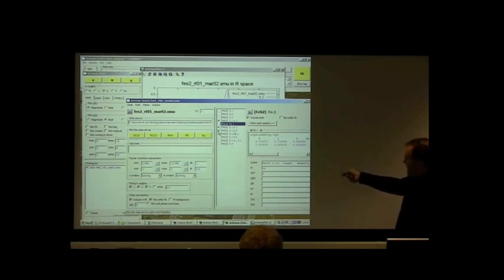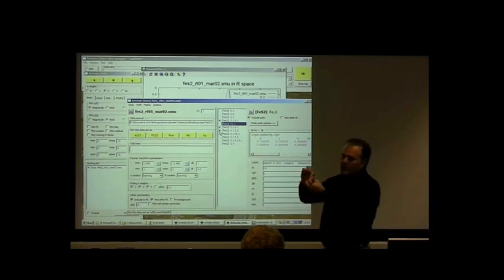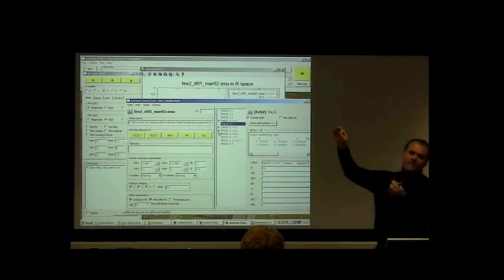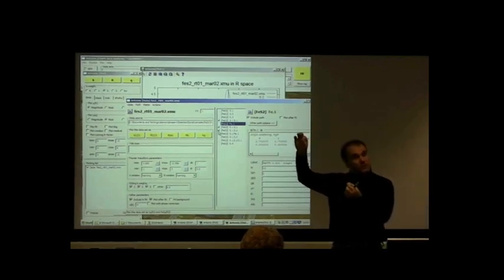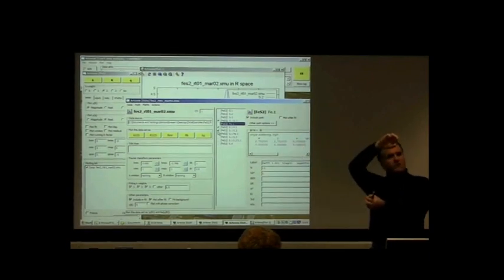So these two that say S1, S1 are two different ways to have the photoelectron leave the absorber, scatter off of a sulfur atom in the first coordination shell, scatter off of a different sulfur atom in the first coordination shell, and then close the loop.